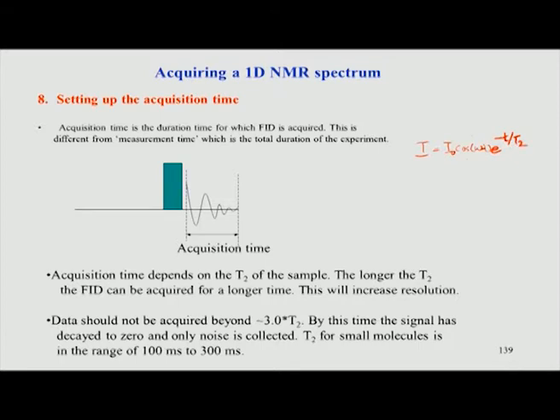So, this is the form of the FID, this is what we saw in the last class. Now, if you look at this parameter here, this is causing the decrease in the intensity with respect to time. So, if I take t equal to 1 times T2, then your I is basically I0 times e to the power minus 1. Let us ignore the cosine term, that does not matter, because that is just an oscillation. Here the exponent becomes minus 1 because t is equal to T2.